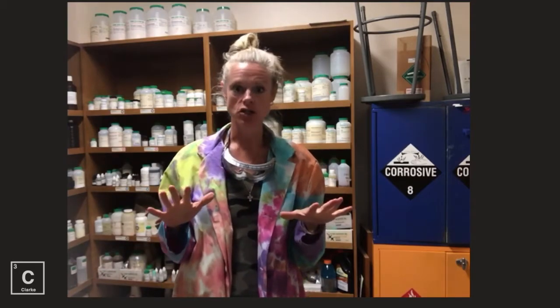You need to pay special attention to the masses of the solute that I'm using, how much water I'm using, so you can calculate the molarity of my solution and then you can calculate the molarity of my new diluted solution. You're going to need a calculator, periodic table, something to write with. Go get your supplies and meet me in the lab. Let's get started.